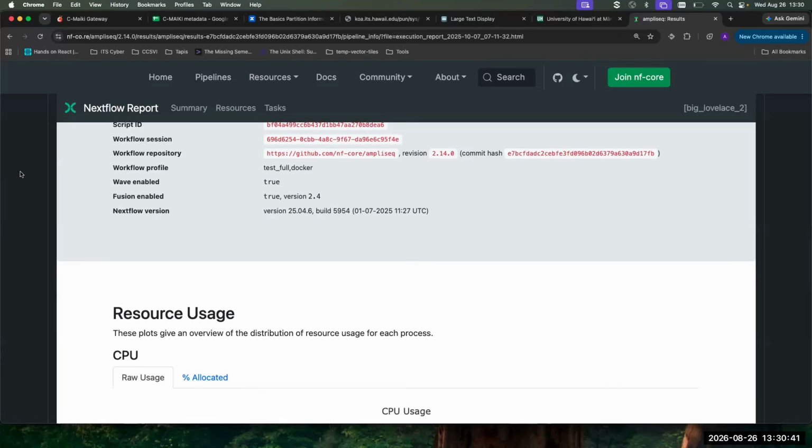So I think that's one of the things that I'd really like to see C-MAIKI do, is make it so that there's those user communities so people can basically give you advice. You can be like, hey, here's how my sequencing run looks. Here's my FastQC for one of my samples. What do you think I should do? It looks really bad right here. Should I trim it more? And basically people could say, nah, it looks fine or something like that. People who are fluent. Yeah.